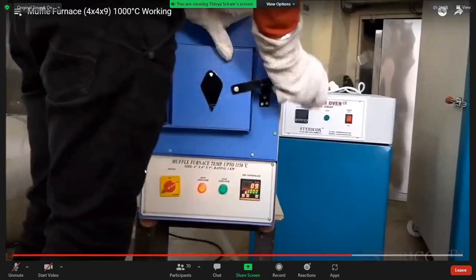To remove the sample from the muffle furnace, we have to use the beaker tongs to remove the crucible from the muffle furnace, because it will be at a high temperature. So we can't take it directly with our own hand. So we have to use the beaker tongs in order to remove the crucible with the sample from the muffle furnace.